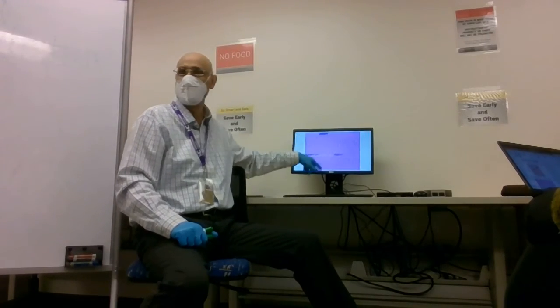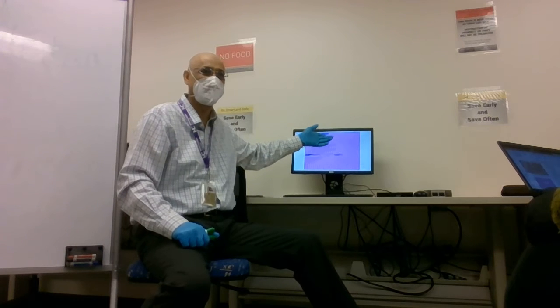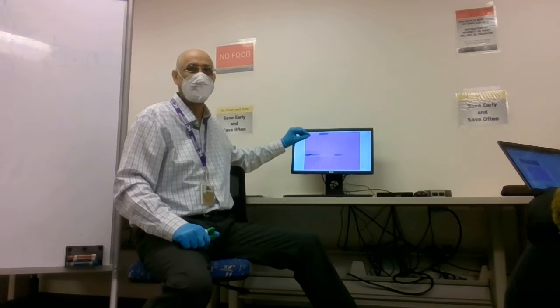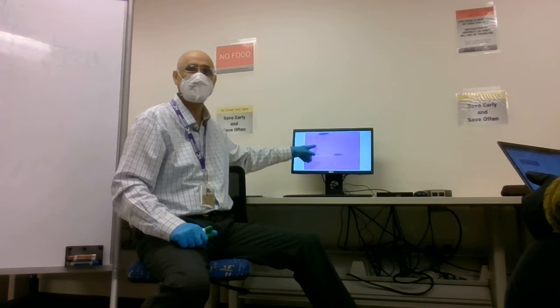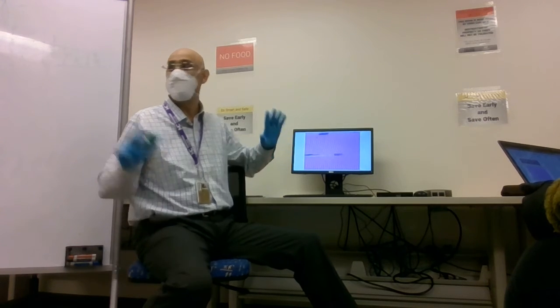On the exam, if it says generally, what are these stripes called? You say they're called the striations, isn't it? But if on the exam it says, what is this dark, is it pink or purple? I don't know. Dark pink. What is this dark pink? A band. A band, everyone agrees, A band.